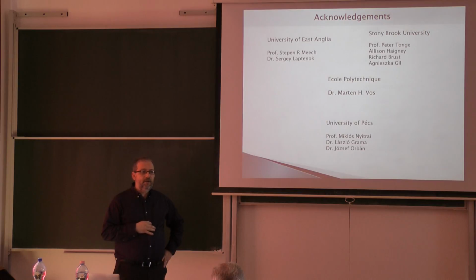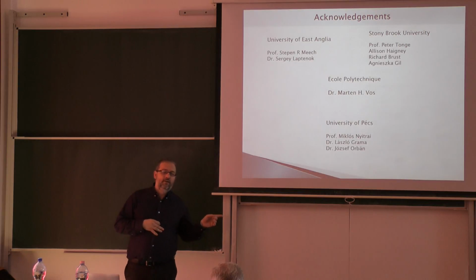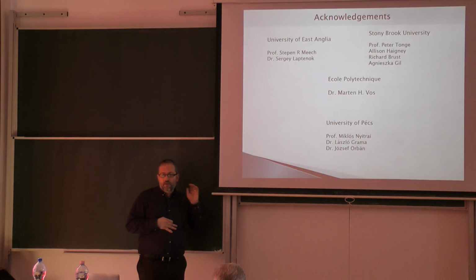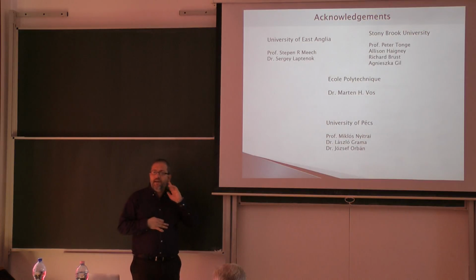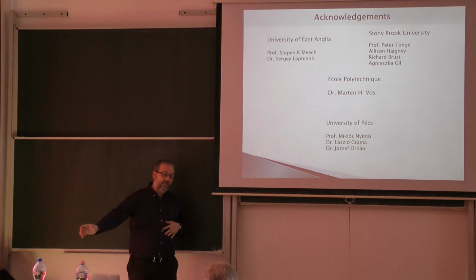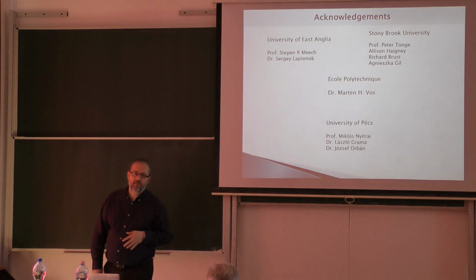My colleagues back at UEA, with that system I just showed you, are already doing third harmonic generation, because they are exciting the tryptophans and want to look at the tryptophan fluorescence. In my case, I chose so far the easy way, because the easy way is 400. You put your crystal, and even if you had a very bad day, you will have second harmonic generation. You have to do something pretty stupid not to have it.